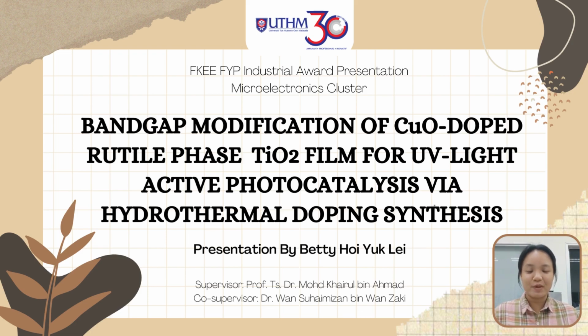Today I will present my final year project, titled Bandgap Modification of CuO-Doped Rutile Phase TiO2 Film for UV Light Active Photocatalysis via Hydrothermal Doping Synthesis. In this video, I will share the results I have obtained, particularly on the characterization analysis, of which there are a total of 6 analyses, and I have done the photodegradation analysis as well.